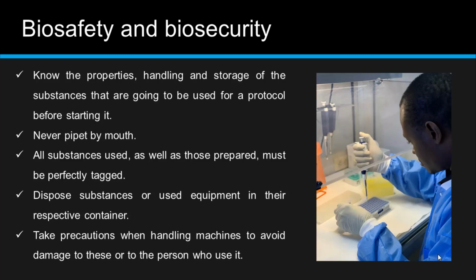Never pipette by mouth. This is a very common mistake generally made by students. We have to use the pipettes. All substances used as well as those prepared must be perfectly tagged. Dispose substances or use equipment in their respective container.